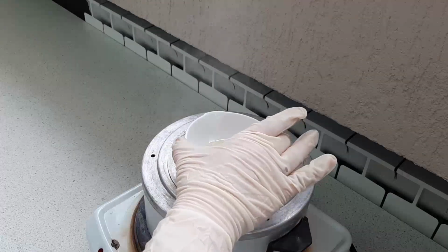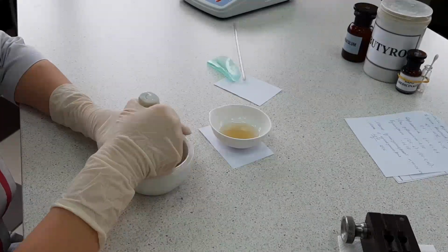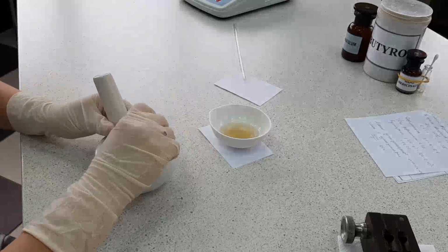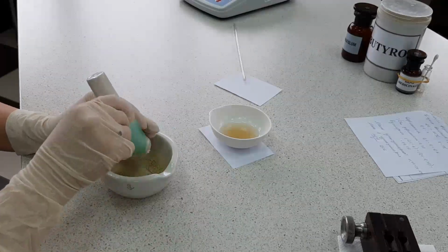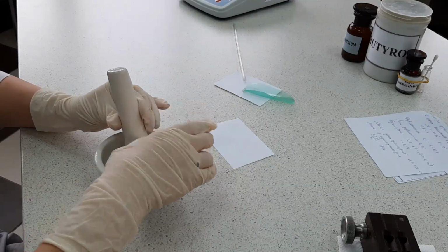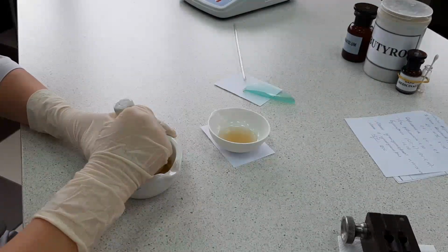Remove the porcelain cup with molten butyrol from the water bath and wipe the condensate residues from the bottom. Grind dermatol firstly dry and then according to Deryagin's rule with half the amount of semi-cooled molten base. Transfer the resulting suppository mass to a porcelain cup with the rest of the suppository base. Mix thoroughly until smooth. If necessary, melt the mass on a water bath.